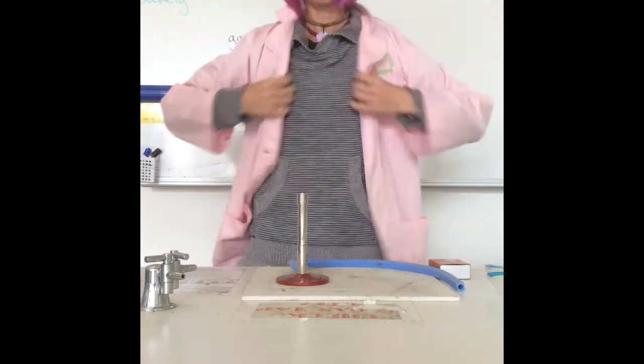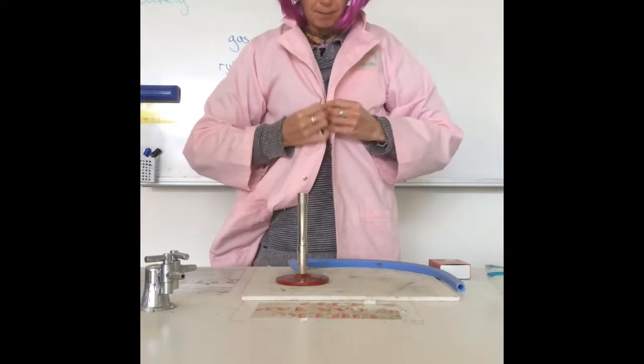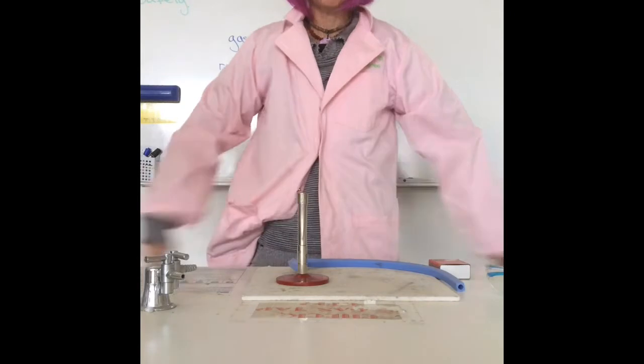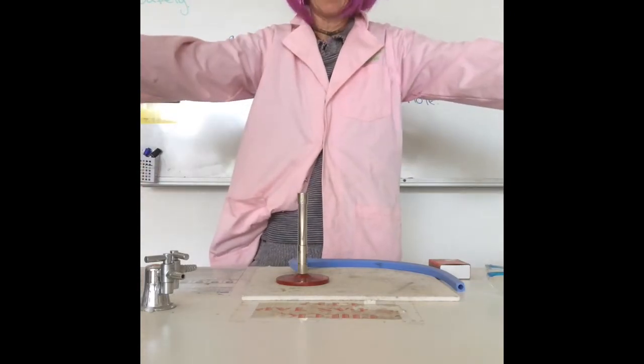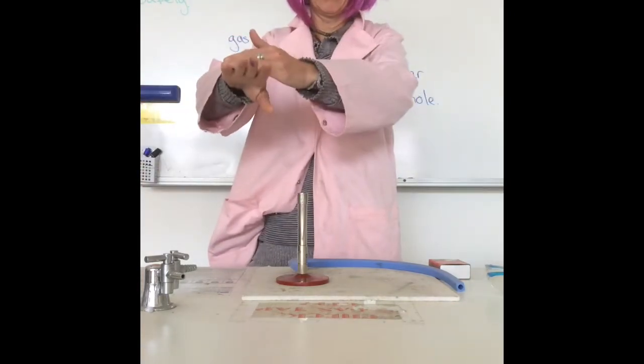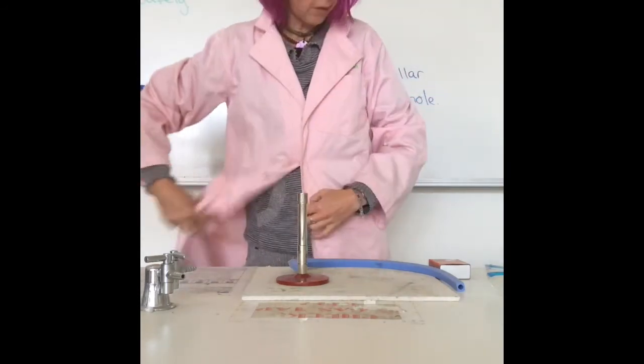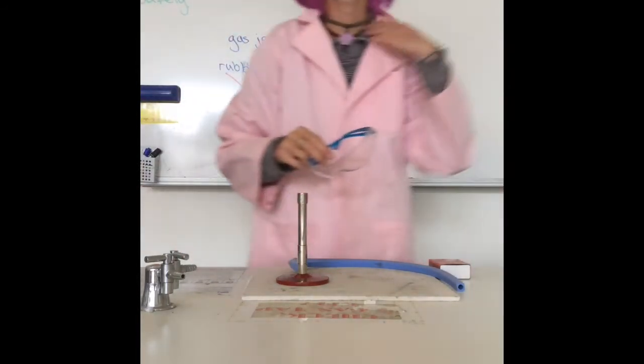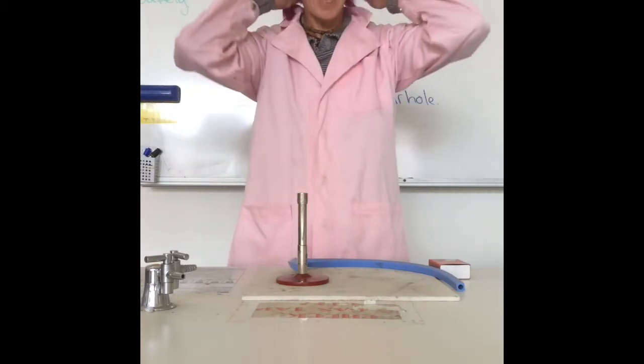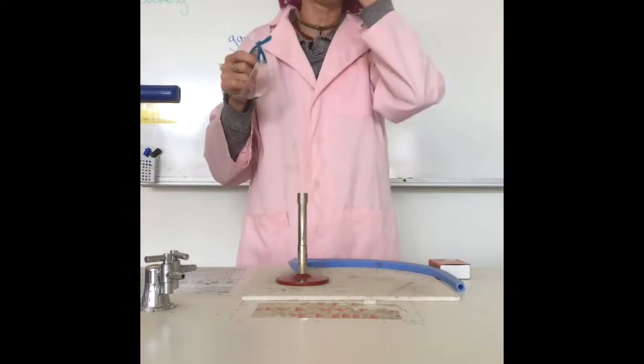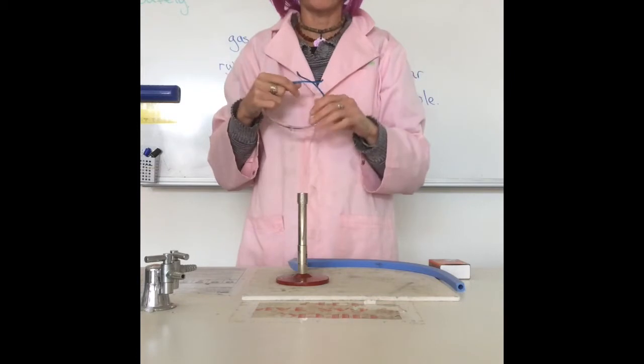Lab coat on. Top two buttons done up. And what you need to be careful with your lab coat is that the sleeves don't go over your hands. I've got my lab coat on. My hair is short enough. A hair band would be good if you've got long hair. Now's the time to tie it back.